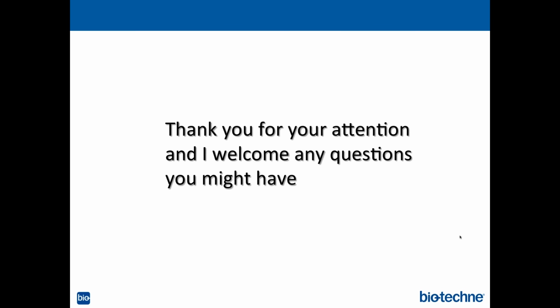Thank you. But I have a follow-up on that. Have you solved any precipitation issues with your antibodies by swapping isotype? Not yet. Okay, you have other issues then. Well, we have precipitation issues with some of the parents, which is what's driving some of these investigations. So we've been able to do it the reverse, where we have a precipitating clone, and swapping the background again addresses that. So that's why we're going around this way.